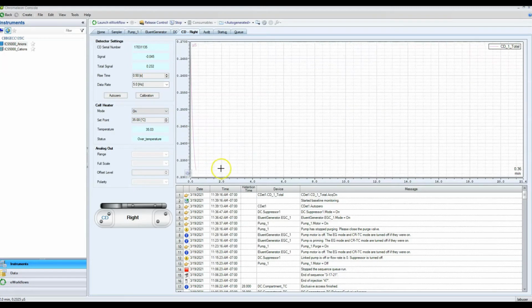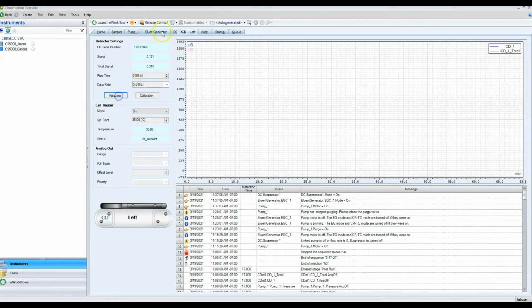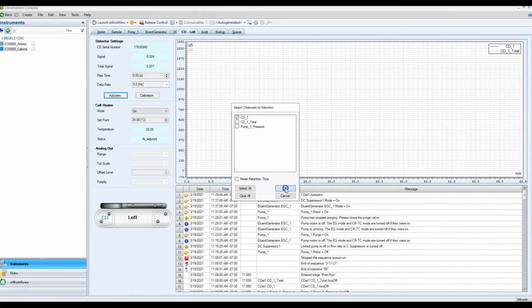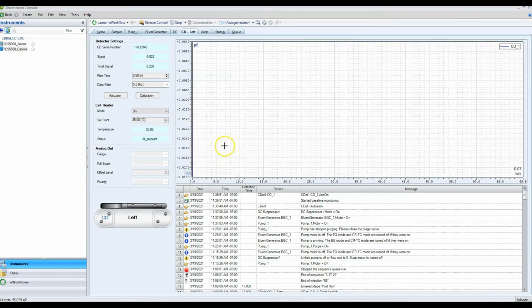So I'll auto scale this, and you can see that it's definitely changing a lot right now, so it is not ready to run. But it's going to plateau out and flatten eventually. That's why we're doing this right now. Here's the same thing for the cation side. Auto 0, monitor baseline, and then I'll auto scale this. And once both of these have stopped changing, that means we're ready to run. But it does take anywhere between 5 and 30 minutes. So that's why we do it now, so that we can set up our run.